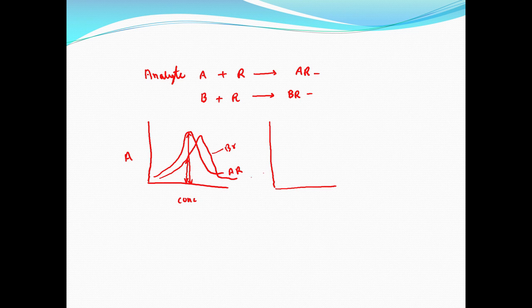So, the actual absorbance curve may look something like this when both AR and BR are present.